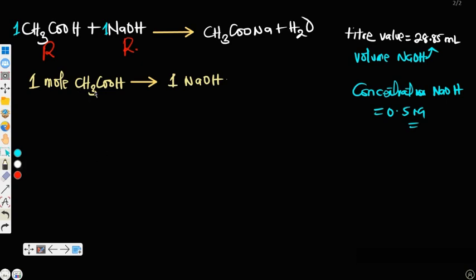Now, what is the mass of 1 mole of acetic acid? Is it 60 grams?